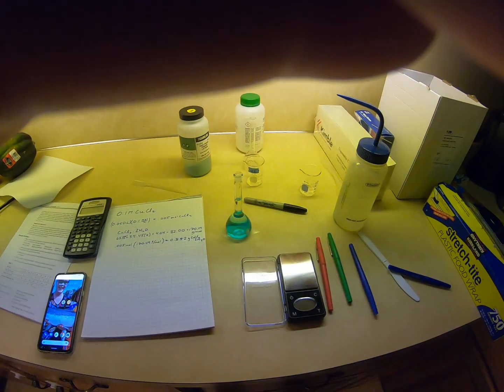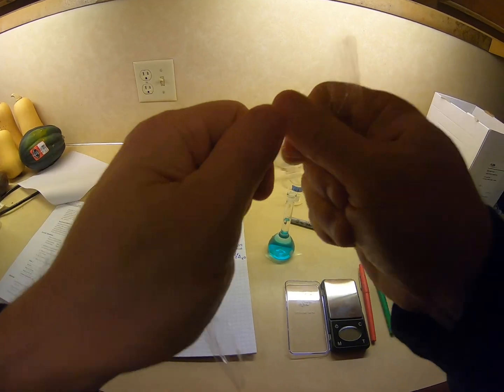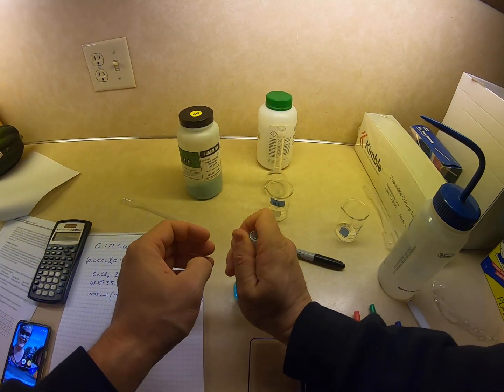Usually we would use parafilm, but I'm not in my lab, I'm in my kitchen. Usually we wouldn't be doing this in a kitchen. And I've got my food cleaned up, and I'll clean up this before I do any food prep.